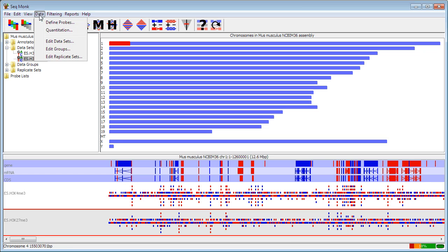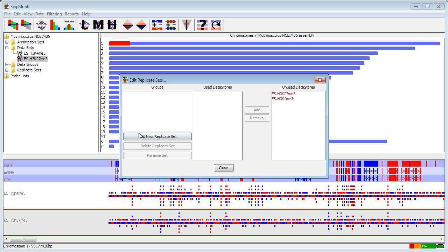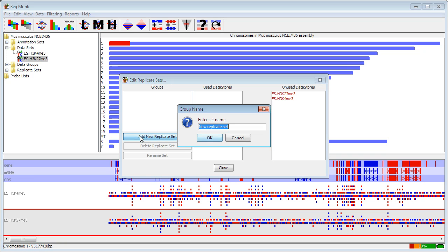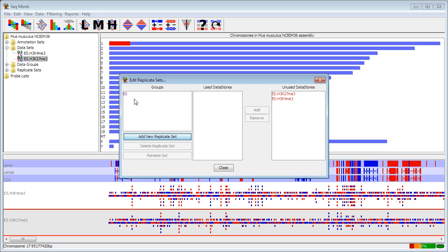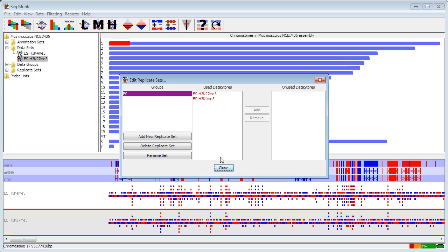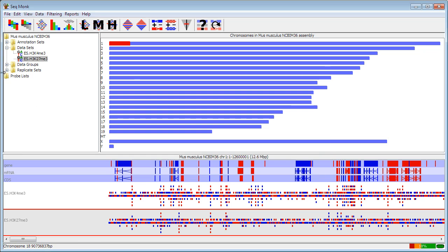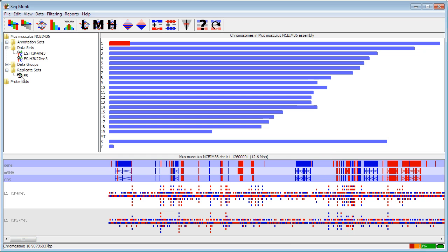To do this, you're going to the Data menu and say either Edit Groups for data groups or Edit Replicate Sets for sets. I'm going to make a new replicate set that's going to be called ES because both of these are ES cell samples. And having made that, I can now add my files to that, and I'll see under my Replicate Sets that I have my ES set group on there.